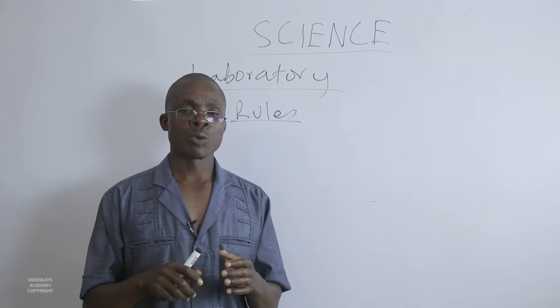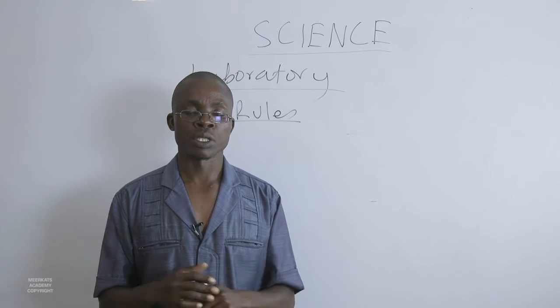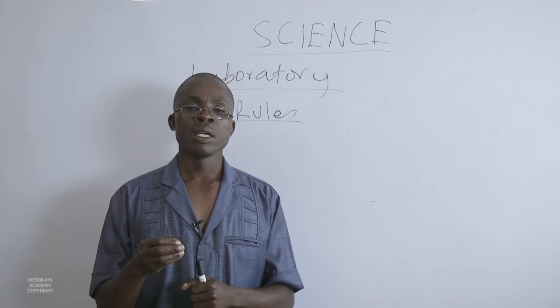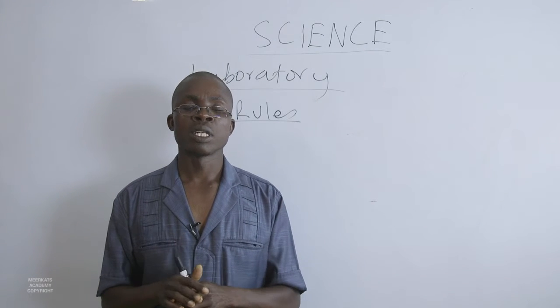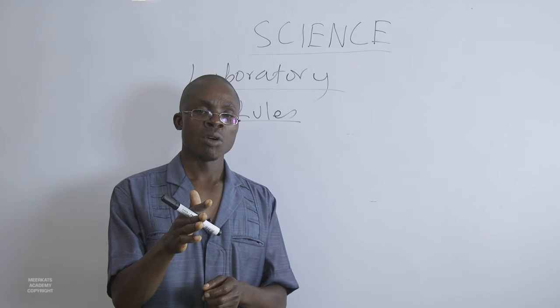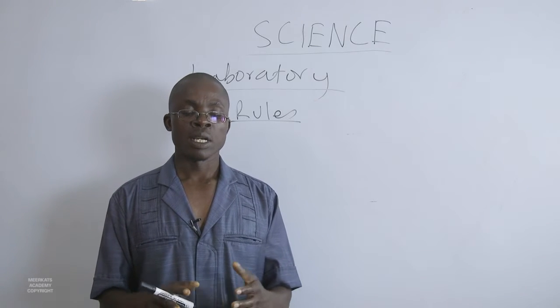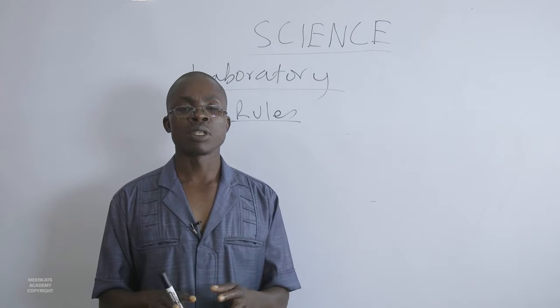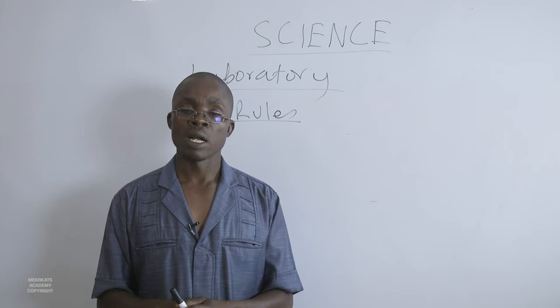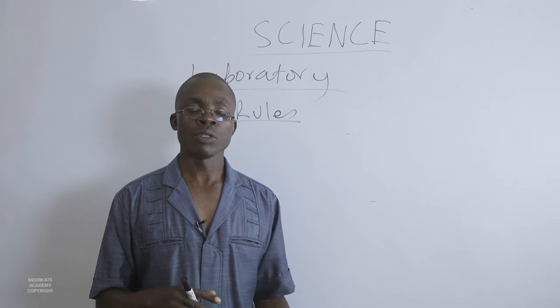The other issue is to do with the footwear. Never enter the lab with just open feet. Remember, in the lab we have glasswares. We shall be talking about them, and we can easily encounter broken glasswares that can cause a very serious injury to your foot, or spillage of a chemical. Imagine a case where you are heating a chemical on a Bunsen burner, accidentally it spills over and you have just a free foot exposed to that chemical, and probably that chemical is something like that sulfuric acid. You will get a serious burn that you may take a very long period to recover, and that is if you will recover.